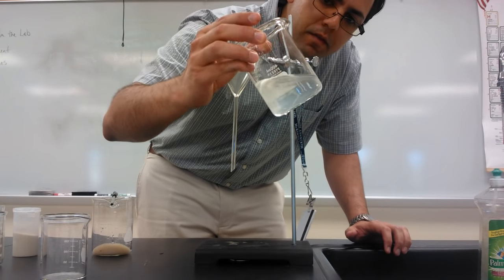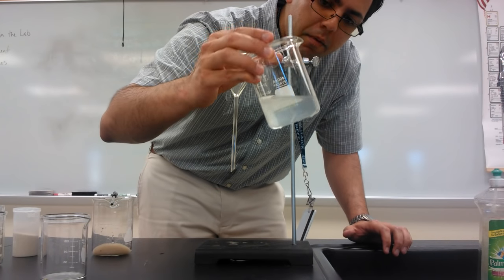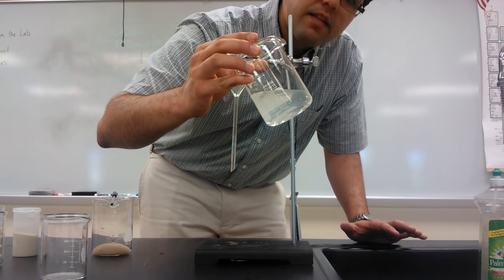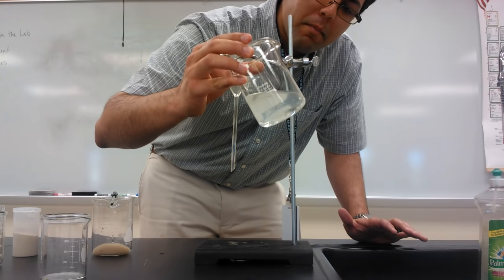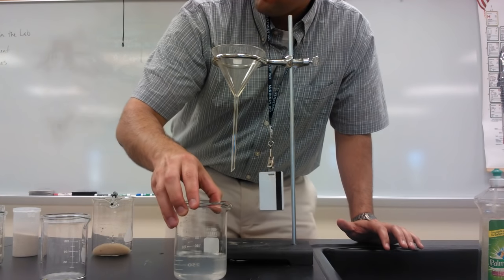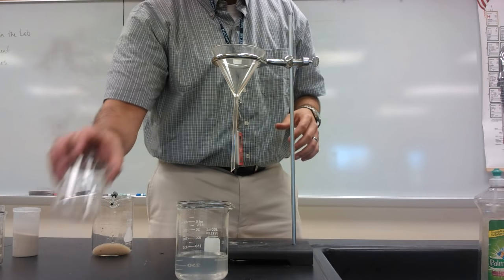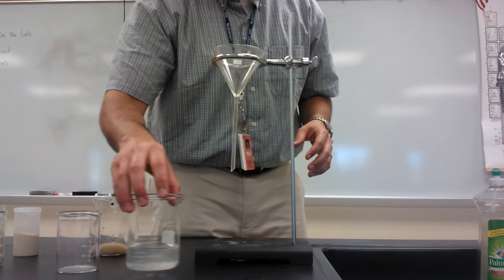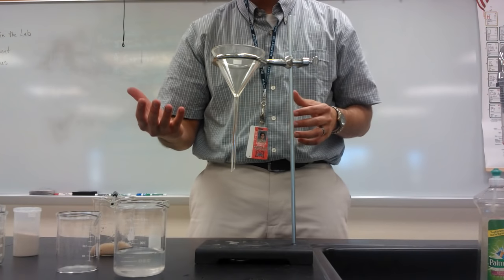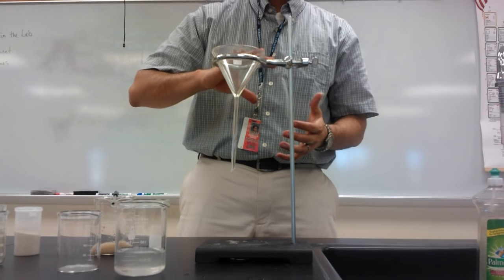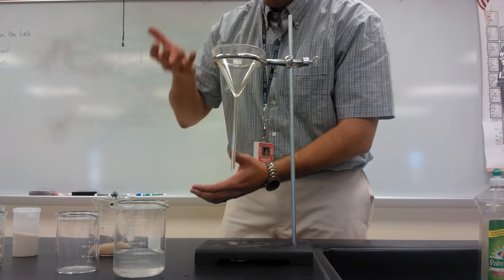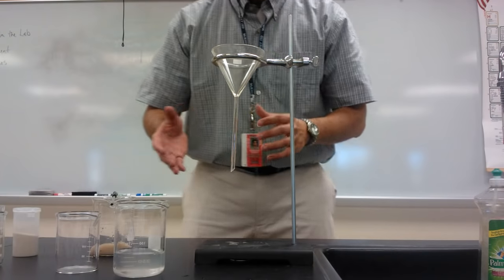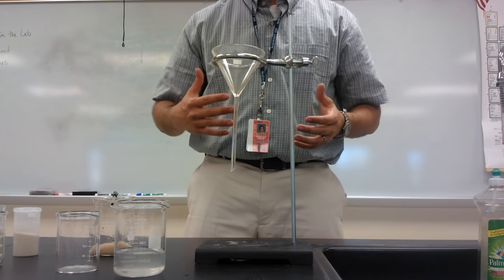But it's a little cloudy — you can see it's a little cloudy. We've got some fine particles in there. So decanting gives us a good initial separation in these types of situations, but we want a better separation. We want to get the most that we can out. So what I'm going to do is set up a system to filter. One of the techniques is decanting — I just showed you that — pouring it out carefully so that we're able to separate the liquid on top from the solid left behind on the bottom. And the next one is going to be filtering.